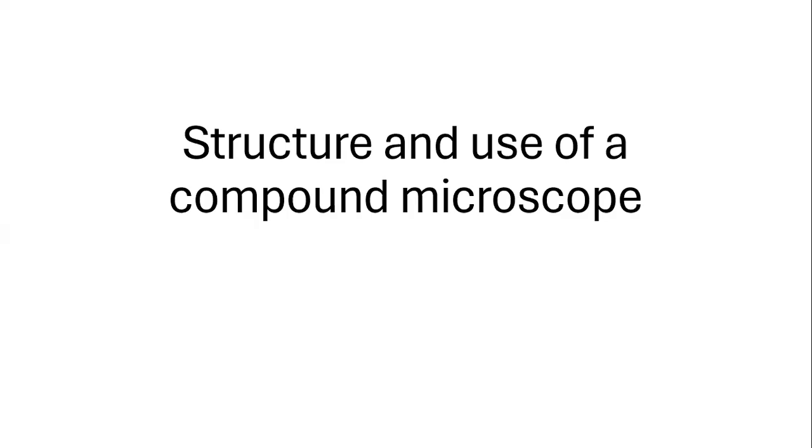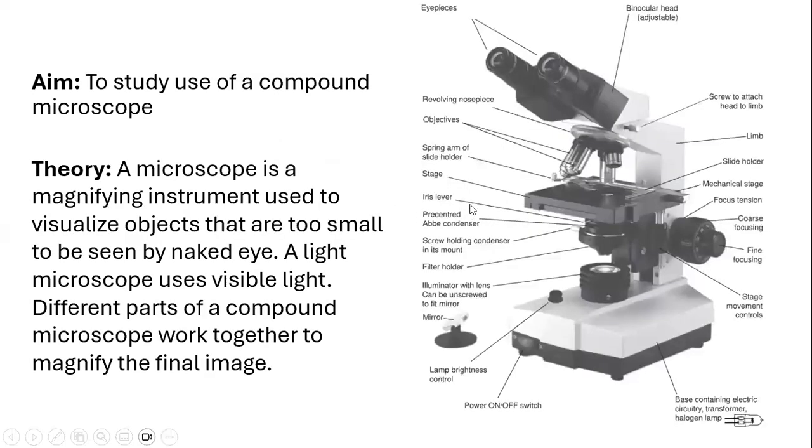Hello students, in today's class we are going to learn about the structure and use of a compound microscope. The aim of the experiment is to study the use of a compound microscope.